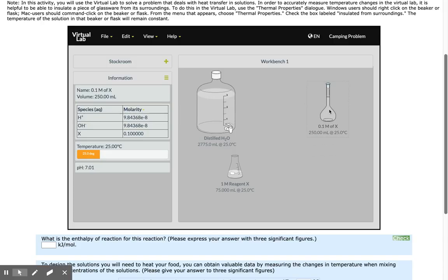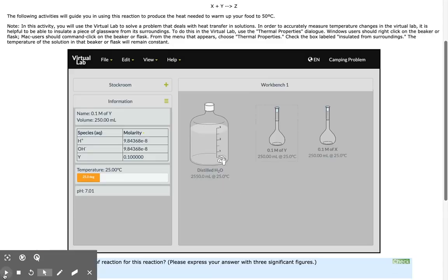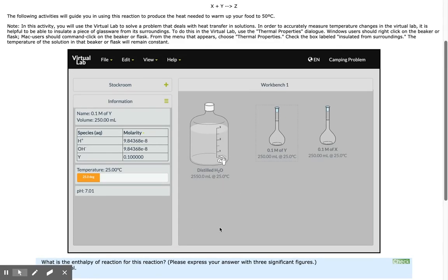Now you would repeat this process for the other solution.